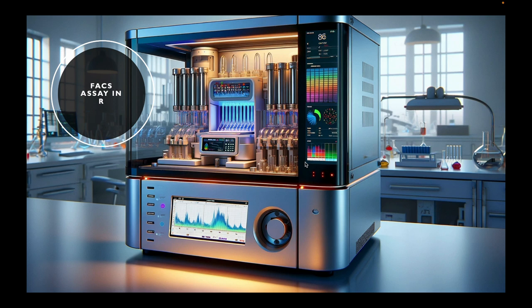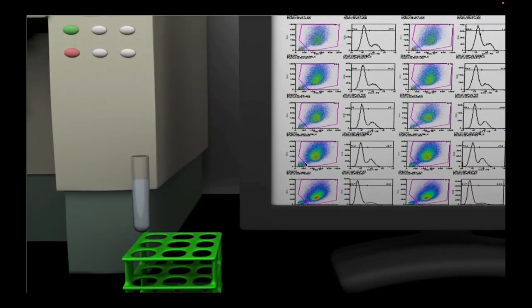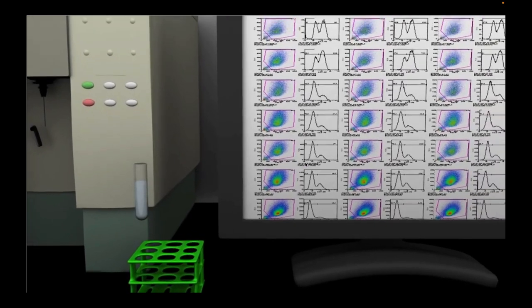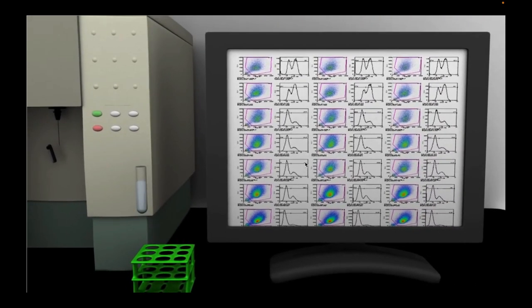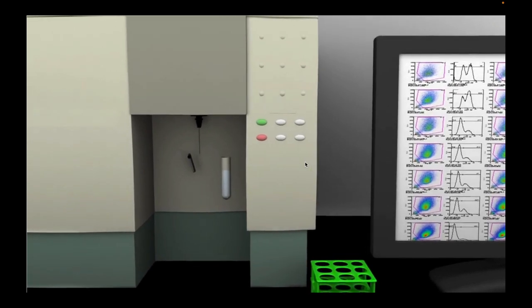We are going to deal with the FACS dataset in our programming language, and this will be very helpful for any analyst doing high-throughput flow cytometry analysis. Evaluating flow cytometry data using R might be intimidating initially, but I strongly encourage its usage and adoption for individuals conducting medium to high-throughput FACS-based experiments.